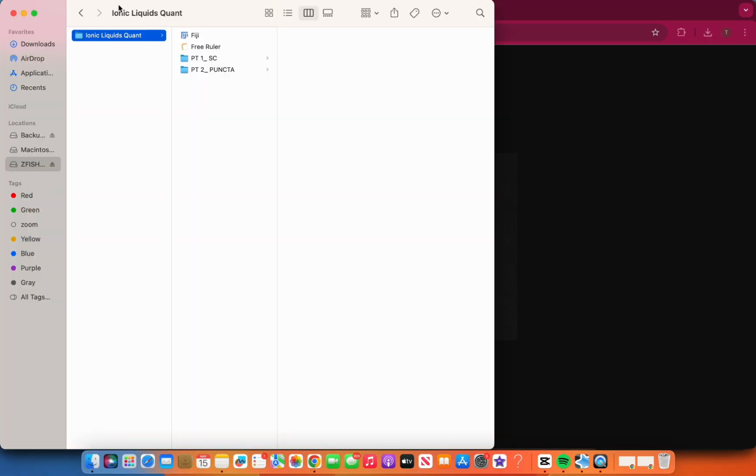To the master video of how to quantify our samples, whether you're imaging for ionic liquids, the KCC2 project, or a completely new project. This is an all-encompassing video on how to standardize, how to compress your image, and how to go about quantifying. So to start, I have created a master folder called the Ionic Liquids Quantification folder.